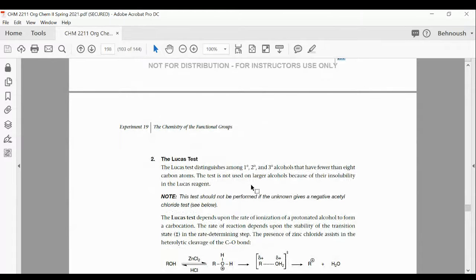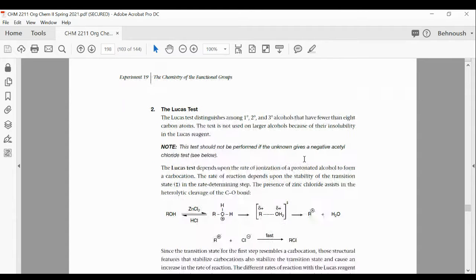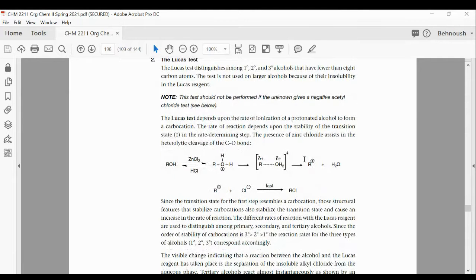So basically, for the next 3 weeks, I'm going to keep the pre-labs very short, like short pre-lab discussions. I just want to make sure to answer your questions. I take attendance, and then you move on with the experiments, because there are a lot of different parts to the experiment, but it doesn't take much time because you don't have reflux. It's qualitative analysis.